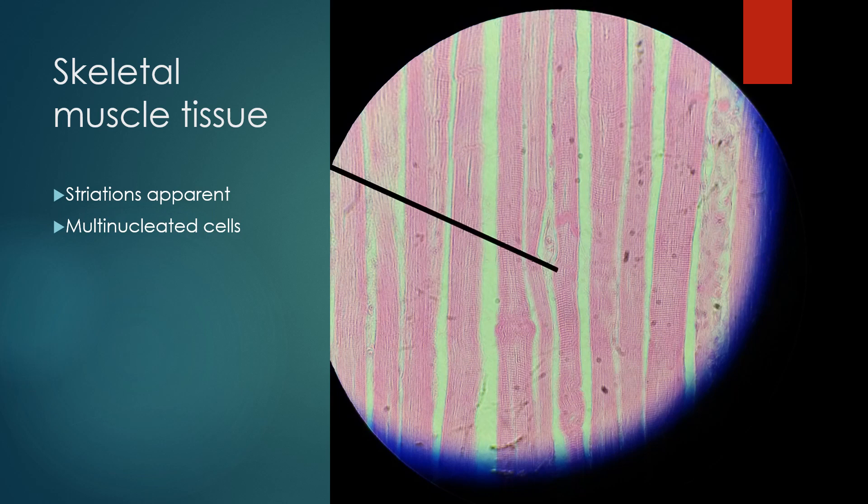Number three was skeletal muscle tissue. This is a longitudinal section of skeletal muscle tissue. To tell whether it's skeletal versus cardiac versus smooth, the first thing I'd suggest looking for is the presence of striations, and this sample does have striations. These fine little lines that bisect these longitudinal muscle fibers are striations, telling you that you either have skeletal muscle or cardiac muscle.